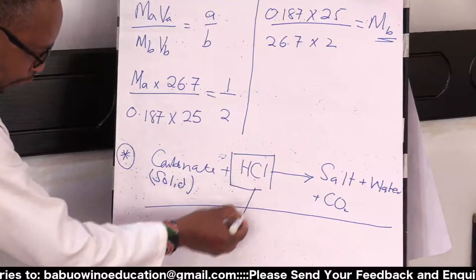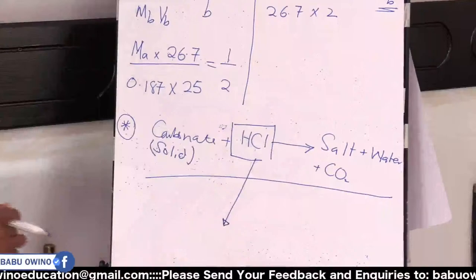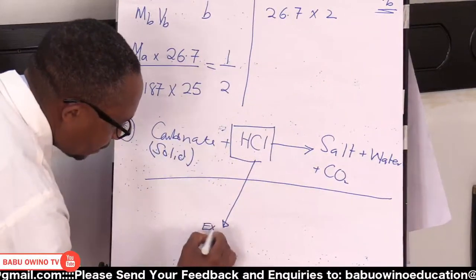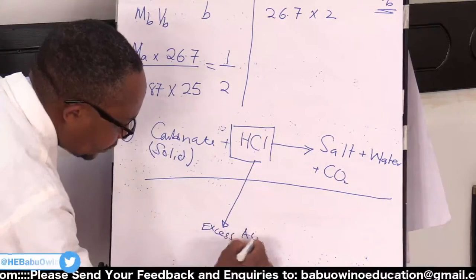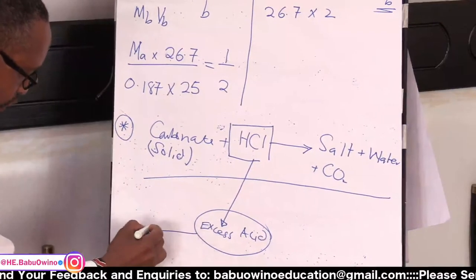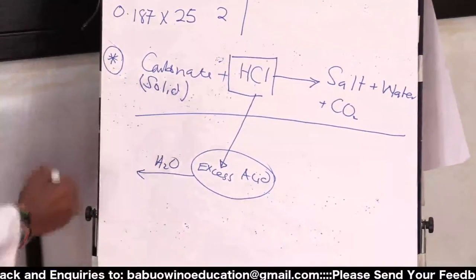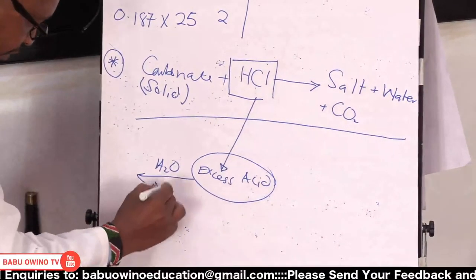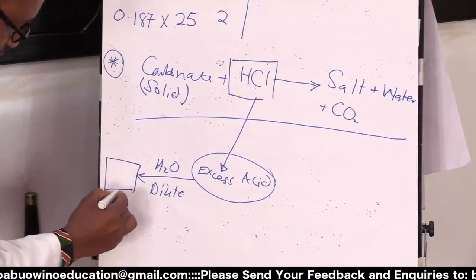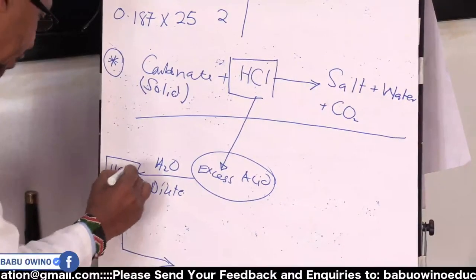Then you are told from there, you take the solution so formed. In this case, it is the excess acid. Then you take the excess and add water to it. This one you dilute a bit. Then whatever you get here, you know this is diluted HCl.